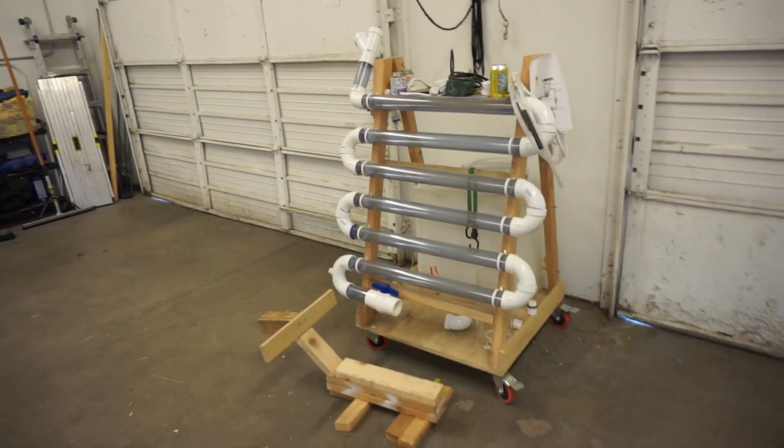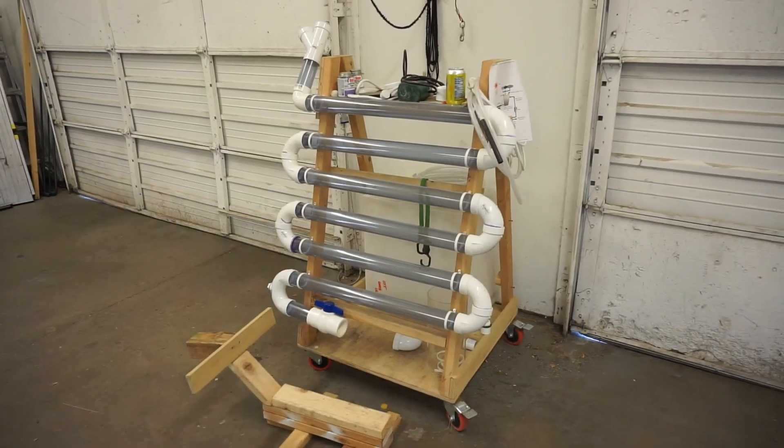So we're gonna do our best to keep you all updated with everything that we do. The next few things that need to happen are of course lights for the five gallon carboys, and then we really got to get the bioreactor finished right here. So we'll hopefully get that finished next week.